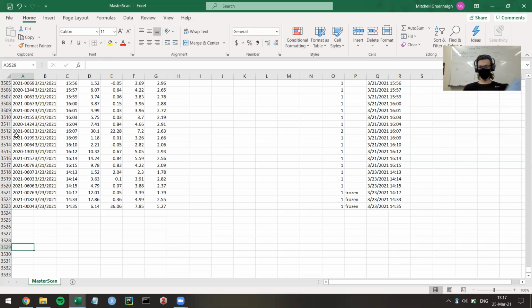But especially for synoptic, like this was for, there's up to 70 sites. And so we want to make sure it's a little more accurate doing it this way for synoptic, and it saves a lot of time instead of having to type in manually every single row of all the 70, 80 sites that we have done on that synoptic day.